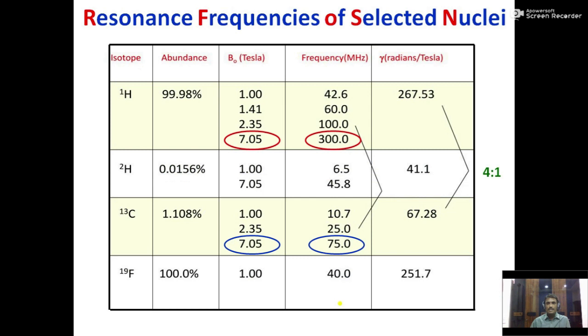Resonance frequencies of selected nuclei I have summarized here. You can see that the hydrogen nuclei is there.